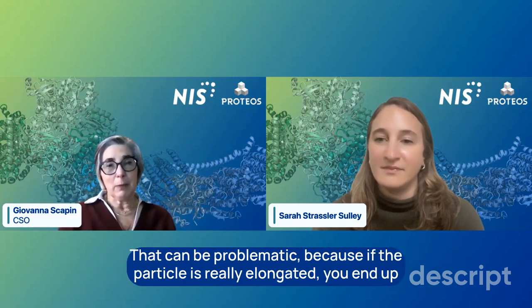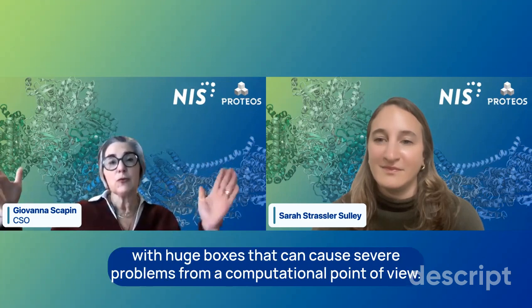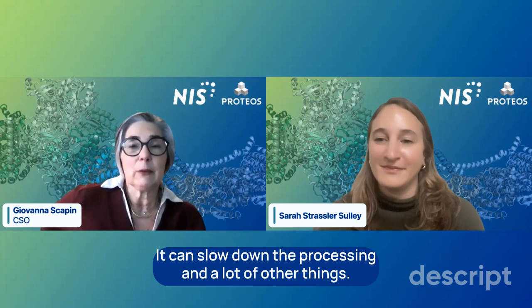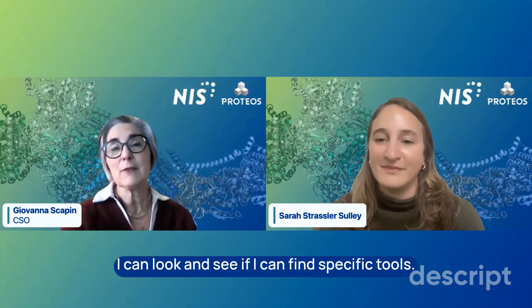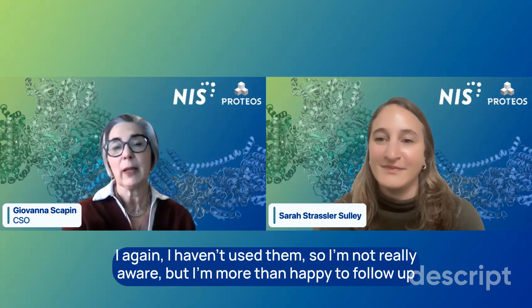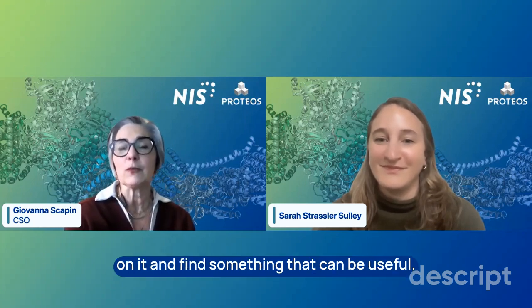That can be problematic because if the particle is really elongated, you end up with huge boxes that can cause severe problems from a computational point of view. It can slow down the processing and a lot of other things. I can look and see if I can find specific tools. Again, I haven't used them, so I'm not really aware, but I'm more than happy to follow up on it and find something that can be useful.